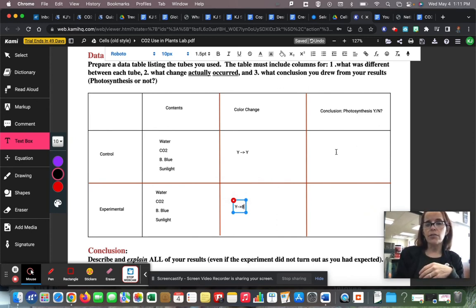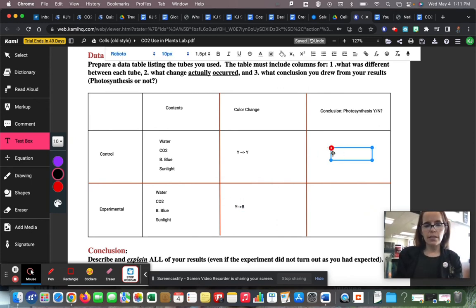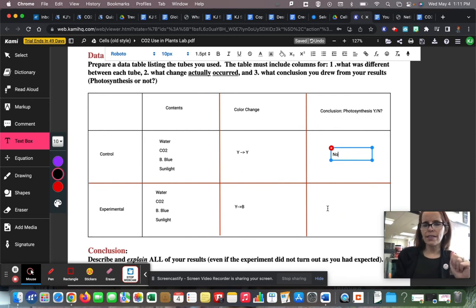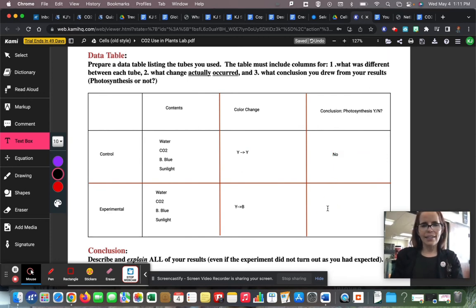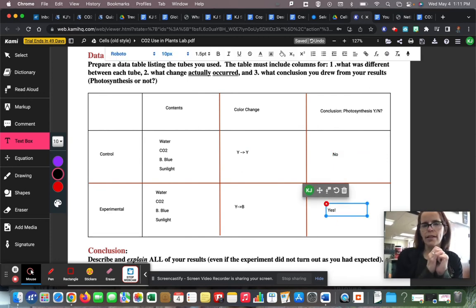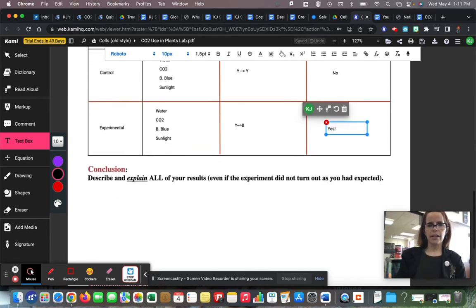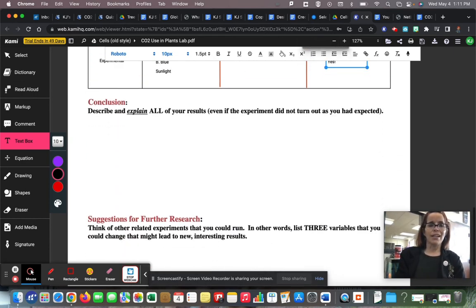So we're back at the data table. The control group did not change color — it stayed yellow. The experimental did change color — it changed to blue. Our conclusion: no photosynthesis occurred in the control, and yes, photosynthesis happened in the experimental test tube.